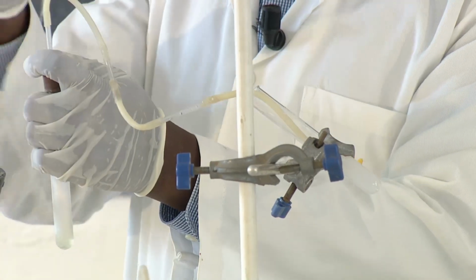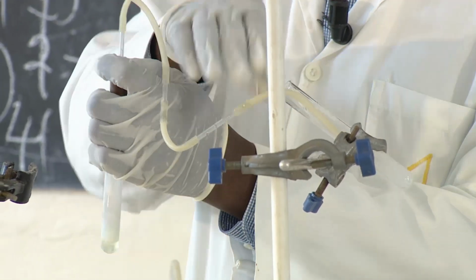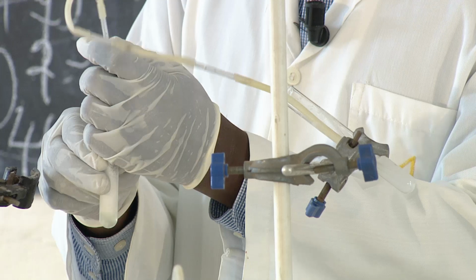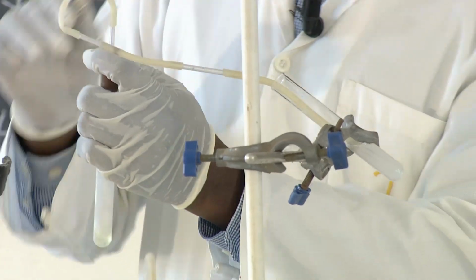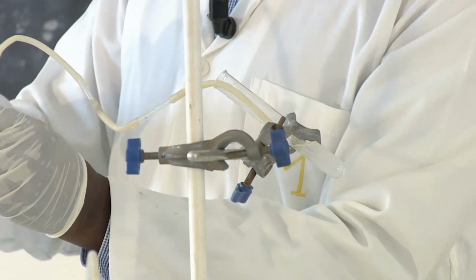By shaking, I just want to increase the rate at which the reaction is taking place. So shaking is very important because it increases the rate of the reaction as well. We can as well add maybe more acid here, to produce more of the gas.